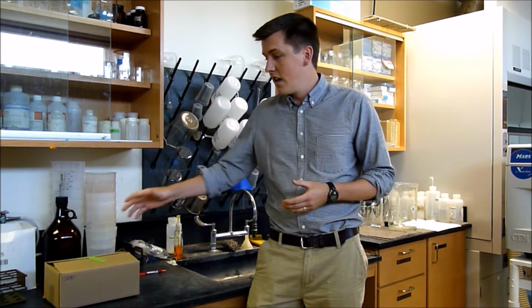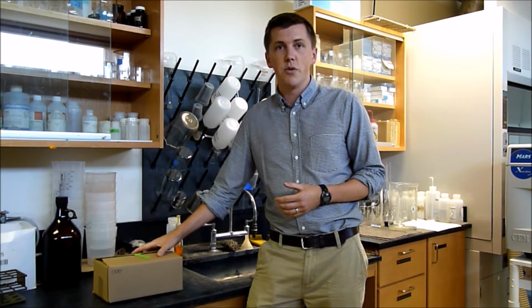Everything you're going to need to do the sampling is the sampling kit box that you received, a pen, and some sort of timing device. So let's see how it's going to go.